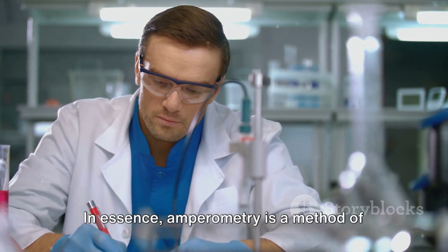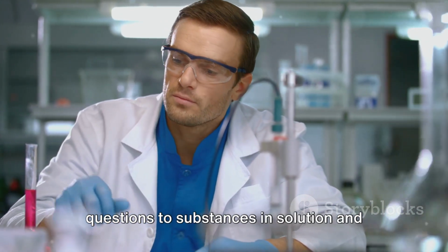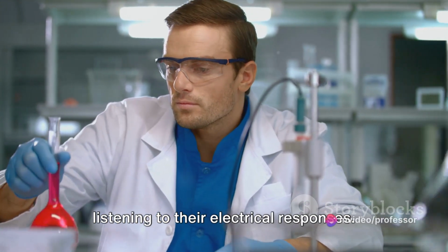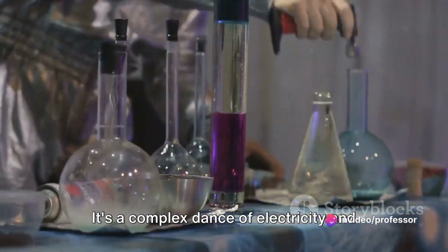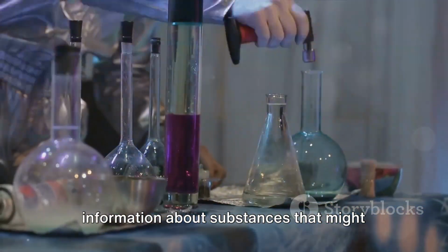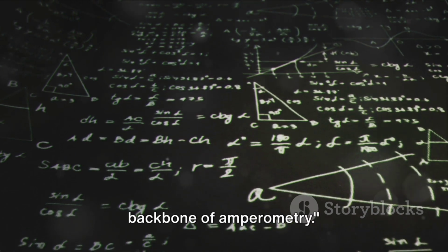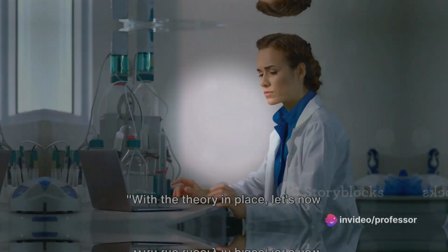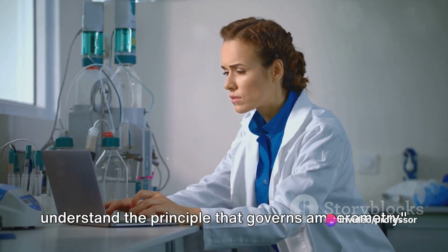In essence, amperometry is a method of probing the unseen, a way of asking questions to substances in solution and listening to their electrical responses. It's a complex dance of electricity and chemistry that allows us to glean information about substances that might otherwise remain hidden. The theory may seem complex, but it's the backbone of amperometry. With the theory in place, let's now understand the principle that governs amperometry.